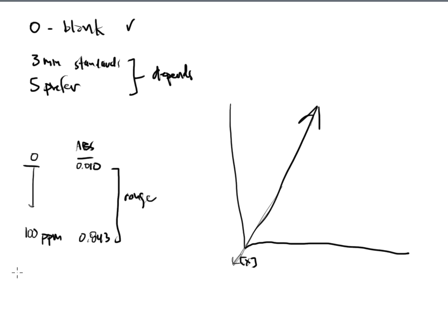So let's say that I then start processing my samples, and let's say that a sample that I process has an absorbance value of 1.13.